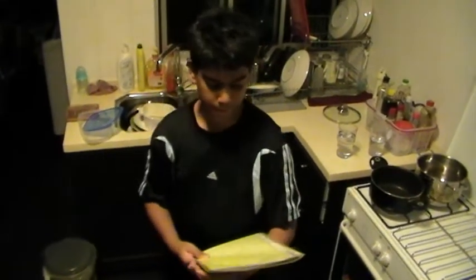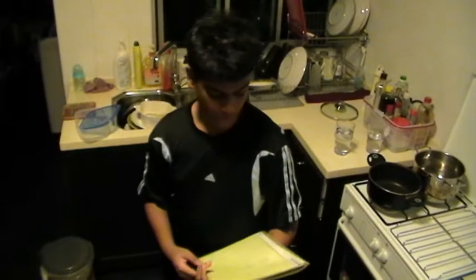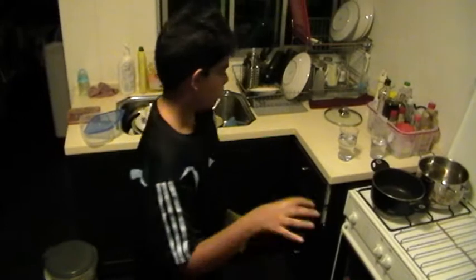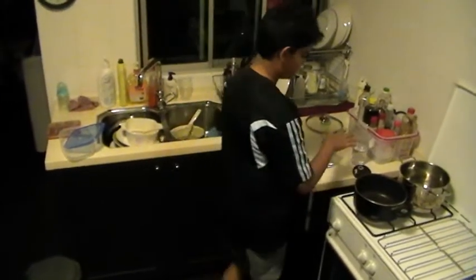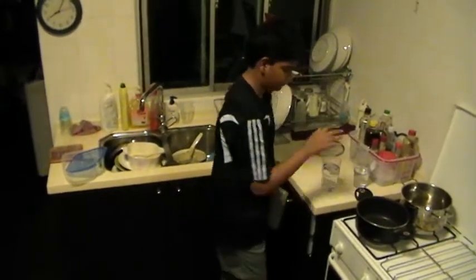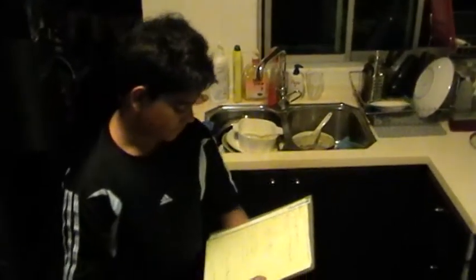Today we'll be doing an experiment to see whether impure and pure substances have the same boiling point. So now the research question is, if we add salt to pure water and boil them separately, so we have salt water and pure water, will the boiling time be the same?